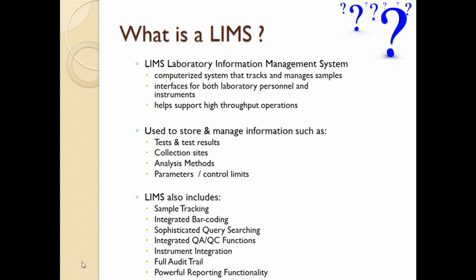LIMS database applications are used to store and manage information associated with the laboratory, and they contain information such as testing of samples and the test results, the collection sites, or where the samples were taken from, where they were transported to, and where they were stored before, during, and after testing.